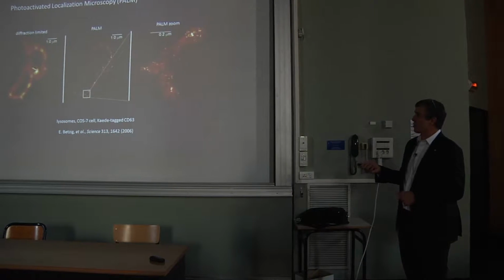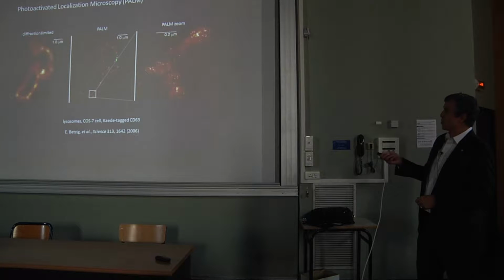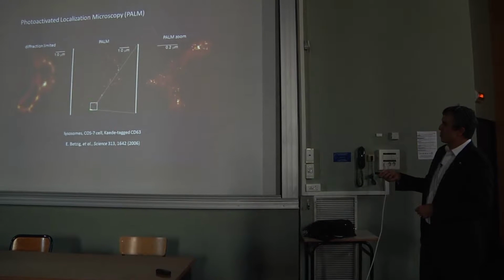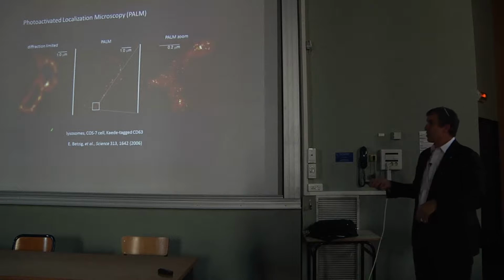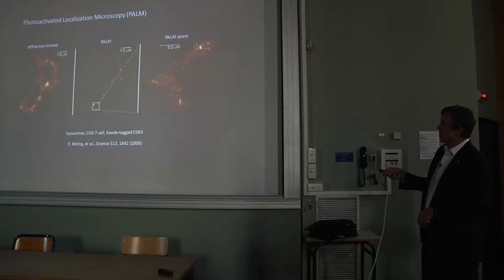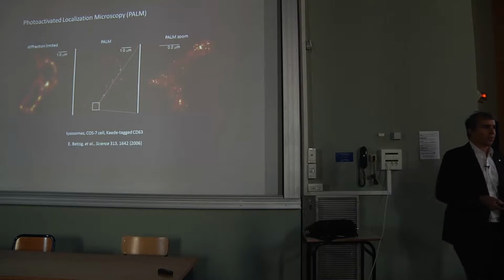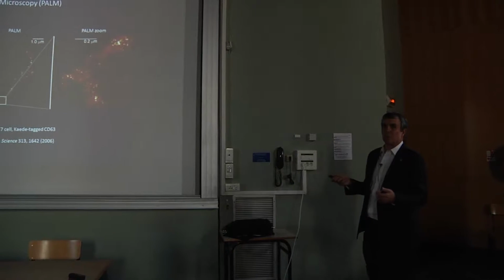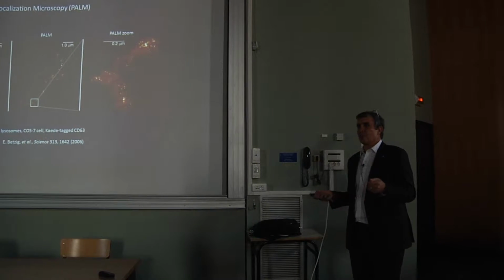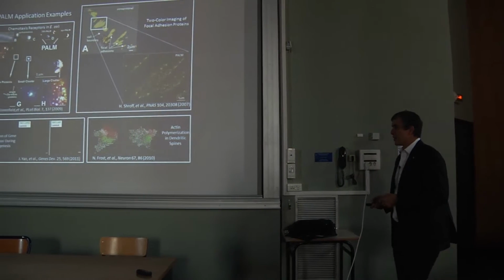The lights in here are really bright and the monitor's dim, so it's hard to see, but this is the diffraction limited image. This is the PALM image, for photoactivated localization microscope. These are lysosomes in a cell, and we're doing a thin cut section to look through those lysosomes. If you zoom in here, you can see the kind of detail you can get. So if everything goes right, and you can take this technique down to about 20 nanometers, everything going right means that you have to densely label the sample, and I'll get into that.